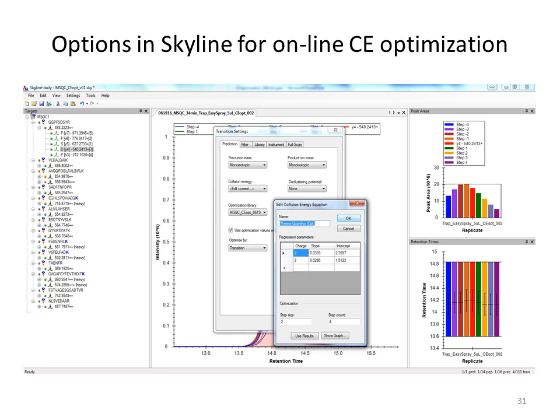You can customize this for your instrument. Most models of the same instrument, for example, all 4000 QTRAPs and 5500s or Quantivas, will have a regression equation that works on that model. And it'll be different for different models and different vendors. And this is empirically determined. So you can always ask your vendor if you don't have a regression in there, but Brendan and his team do pretty well updating it.